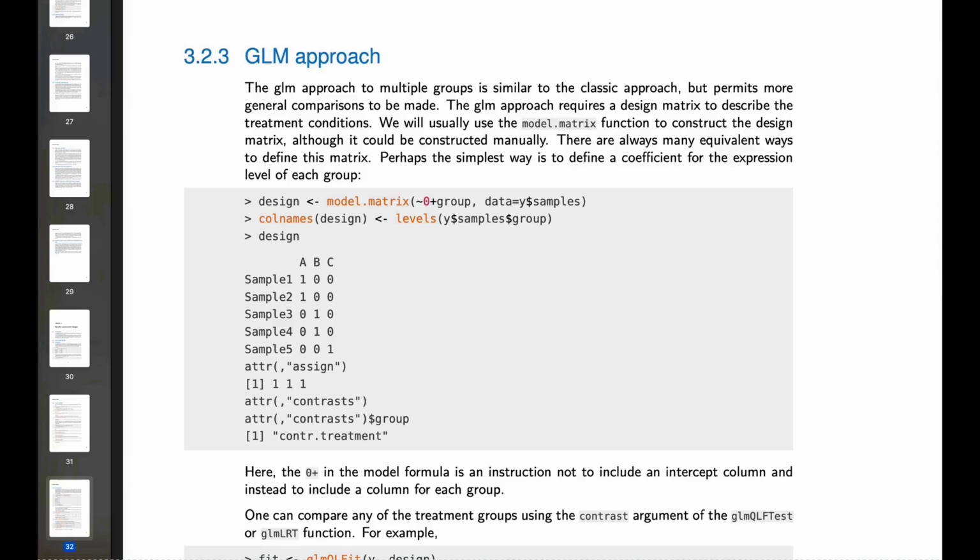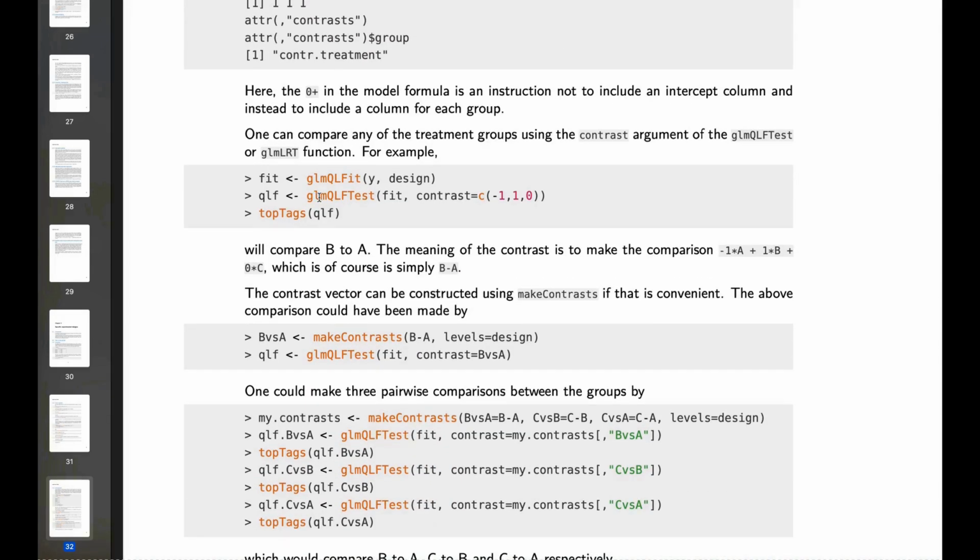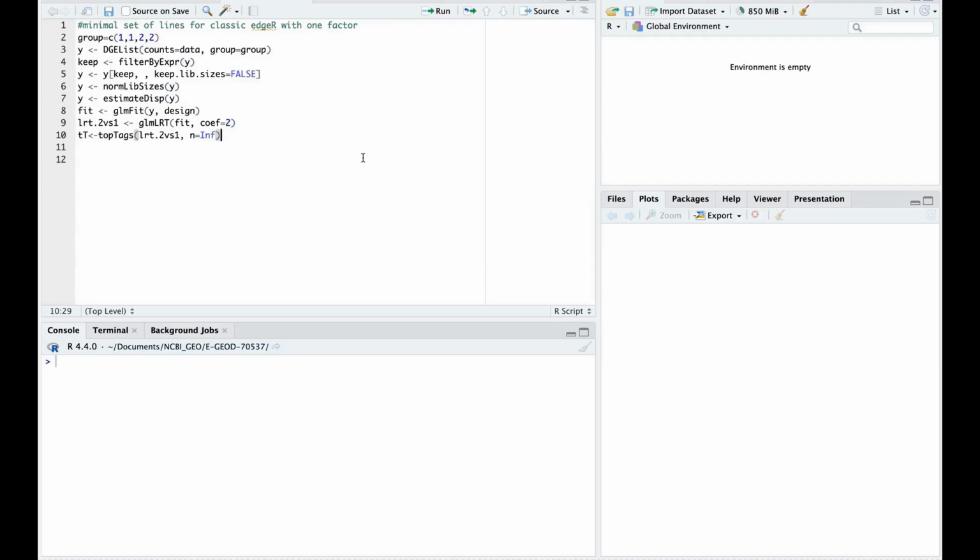Why alternative? In chapter 3 you will see the glm approach is reserved for the script with the glmQLFit option. Those functions glmFit and glmQLFit sound pretty close, and you might think they do something similar, but they're probably based on different algorithms, and you are quite right with this.